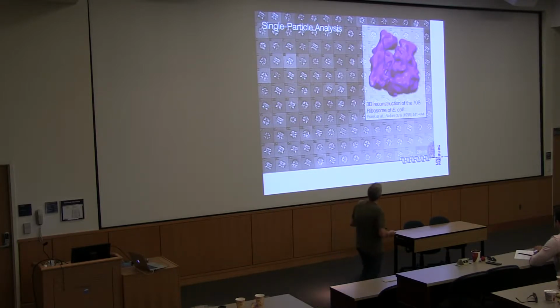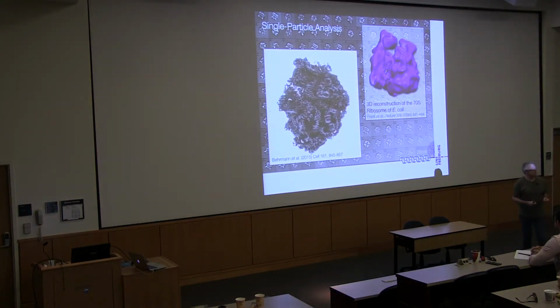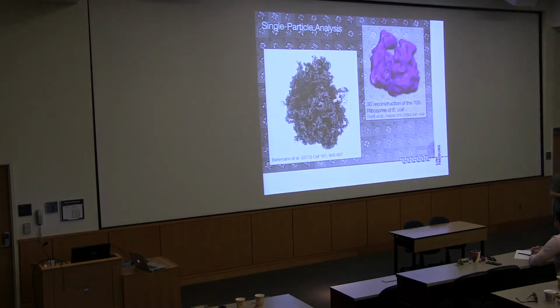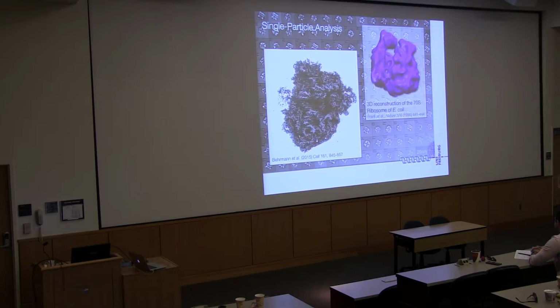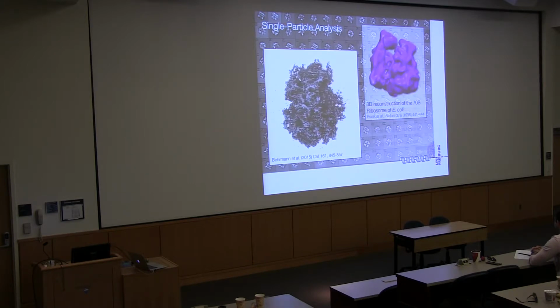So I tell you, because nowadays this same technique led to images of the ribosome that look like this. And that is what's called the resolution revolution. This is mainly due to new detector technologies, new microscope technologies. And this whole field is moving a lot. And that is really what I had on the first slide. That is atomic microscopy in the true sense that you just actually visualize an object.